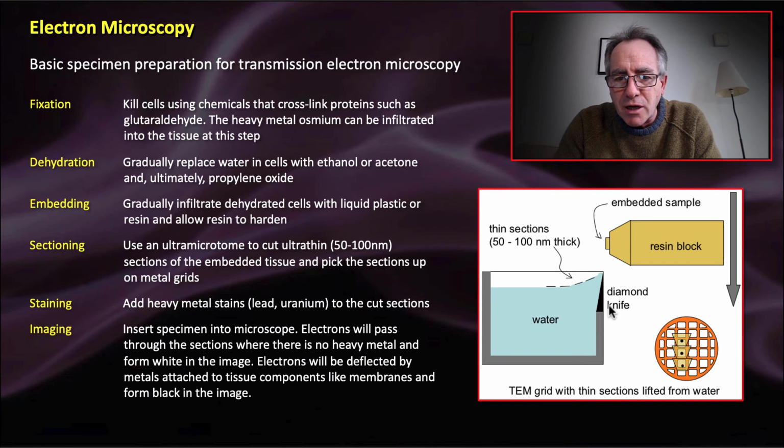You can use a piece of broken glass as your knife blade, and there's a real skill at making glass blades, so-called, that are nice and sharp, wickedly sharp. But something that's even sharper and lasts longer than a glass blade is a diamond blade. So we're using diamonds here in this electron microscopy step. The diamond knife blade, by the way, can cost thousands of pounds. This specimen moves by the diamond knife blade in little teeny tiny thin sections.